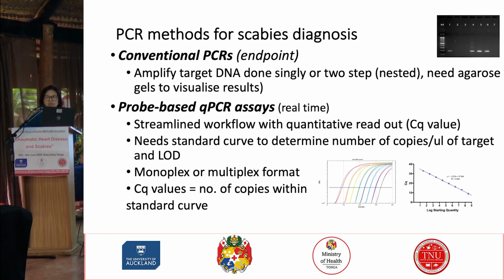And these values are synonymous to the number of copies that you have put in your little tube from the DNA that you have extracted, the genetic material from your sample that you have collected. So it gives you an amplification readout of how it happens in real time. That's why it's called quantitative polymerase chain reaction. It's a real-time variation of the PCR.